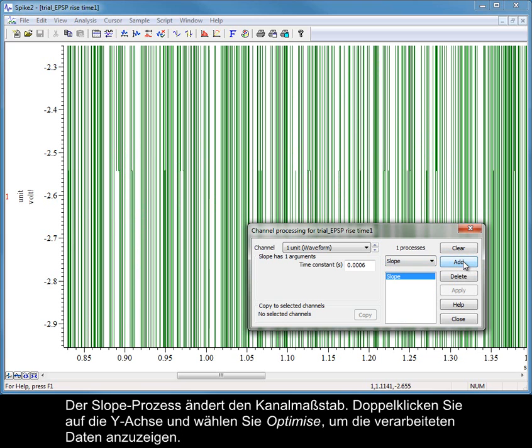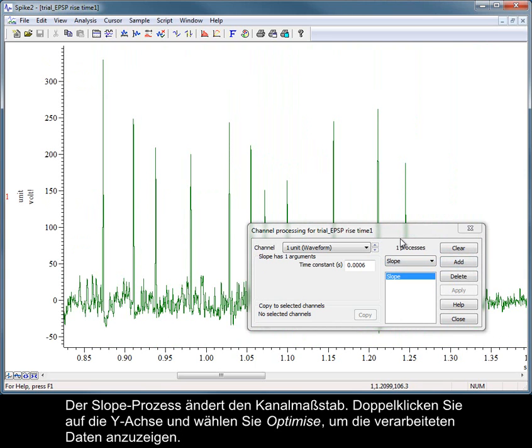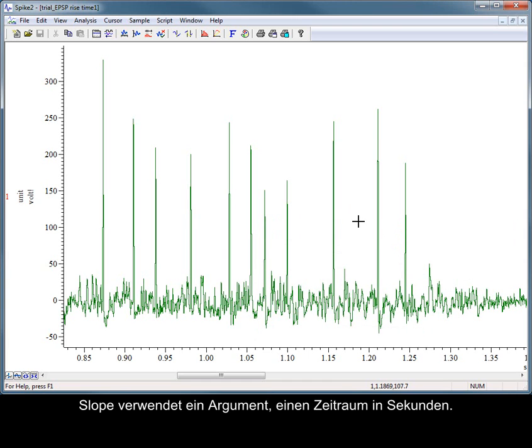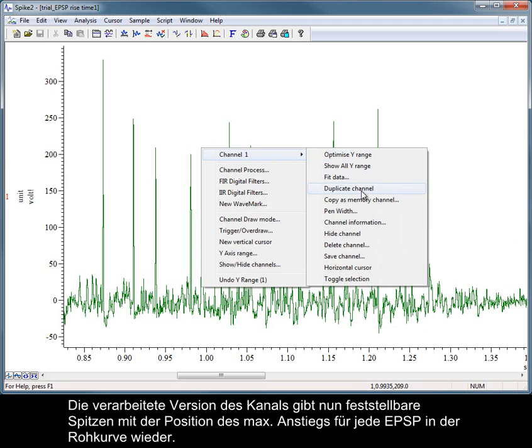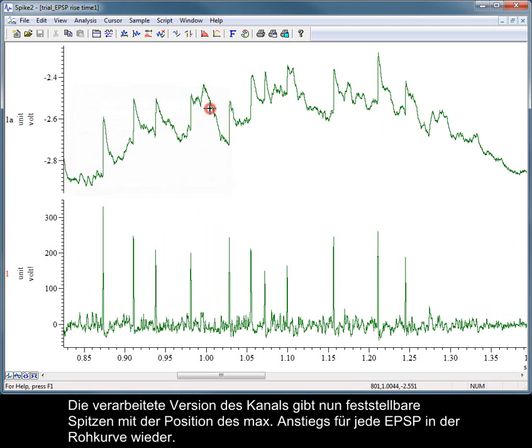The slope process changes the channel scale. Double-click on the y-axis and click Optimize to show the process data. Slope uses one argument, a time period in seconds. The processed version of the channel now shows detectable peaks marking the position of the maximum slope for each EPSP in the raw trace.